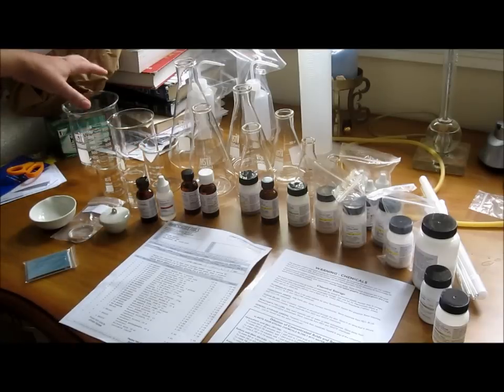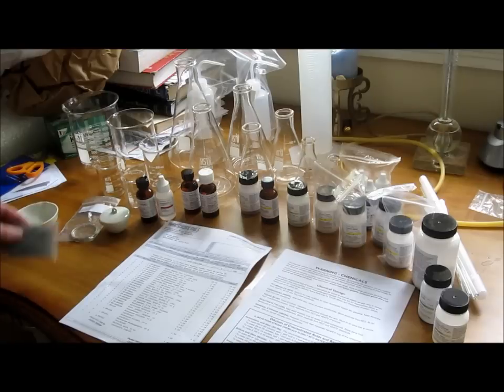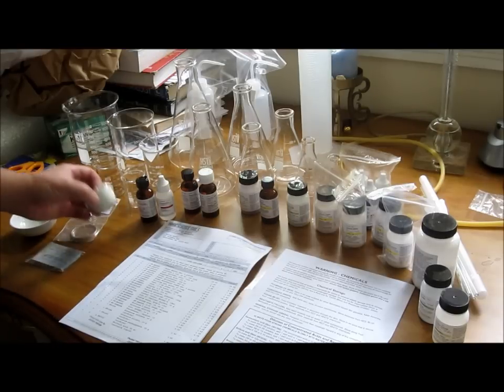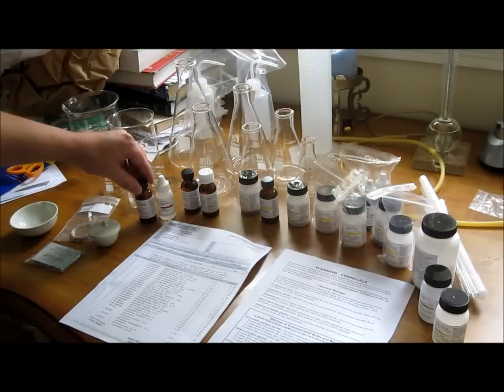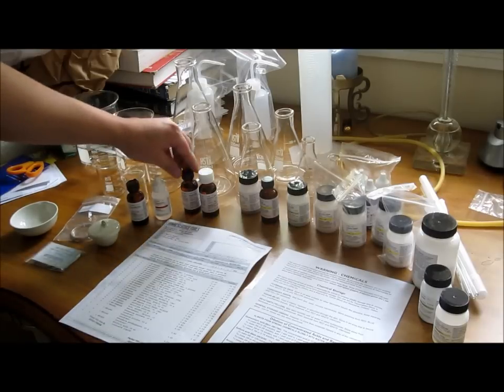So besides Erlenmeyer flask and beakers, I got an evaporating dish, some magnesium ribbon, pH paper 1-14, 80 strips, small crucible, some grams iodine stain, phenolphthalein solution for acid-base titration.